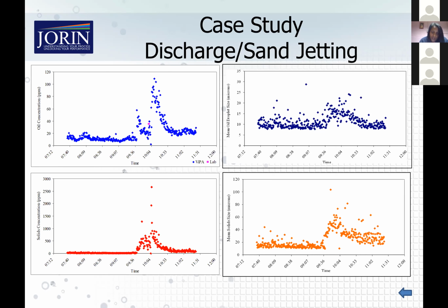They were actually doing this once or twice a day, but it's very short, literally they were putting the high pressure water in through the nozzles for maybe maximum 30 seconds with the idea to fluidize all the sand, and then their vacuum pumps will remove as much of it as possible. So they are actually discharging their oil and their produced water. They have a discharge spec, roughly about 30 ppm is what they want to achieve.